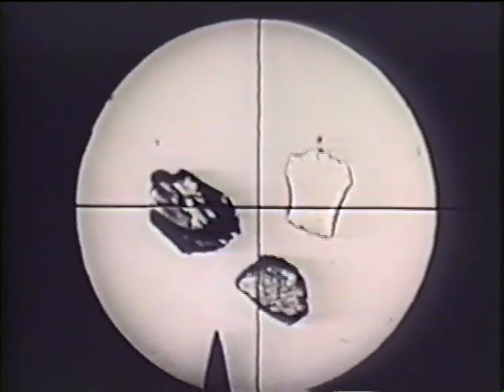Ordinary glass, water and air are not crystals but they also are isotropic. Here are isotropic fragments of fluorspar, garnet and glass. They do not change as the stage is rotated.